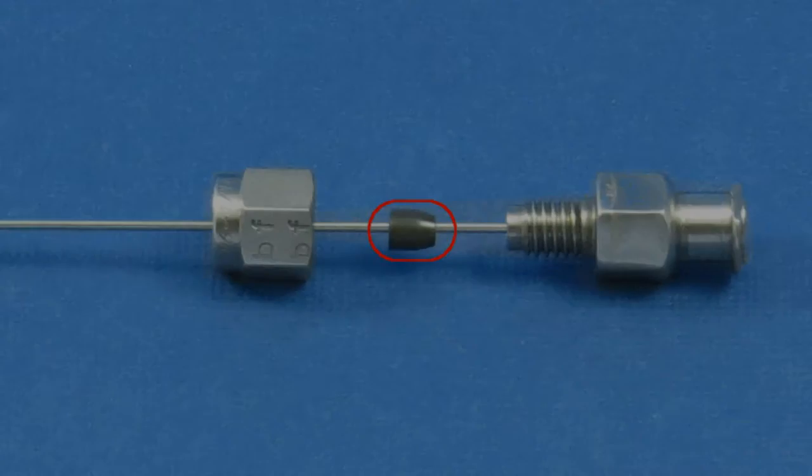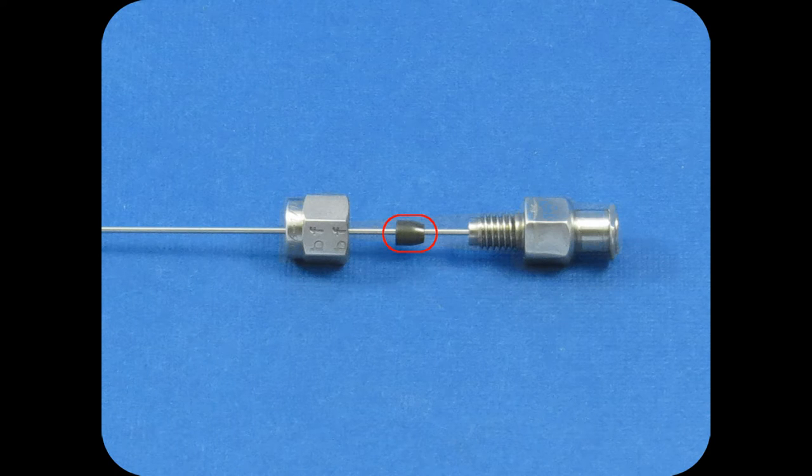Then, choose the correct hypodermic tubing adapter ferrule to make the connection. Remember, not all sizes of hypodermic tubing can be used with all ferrules, so if you have any questions about which one to select, our hypodermic tubing adapter ferrule video gives more details and is linked below.